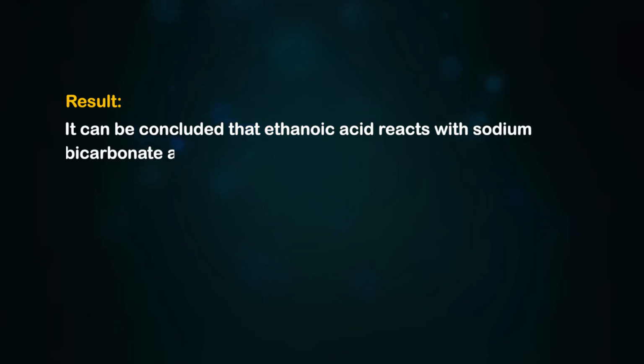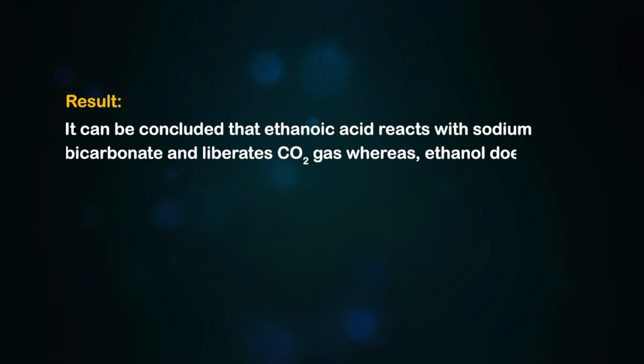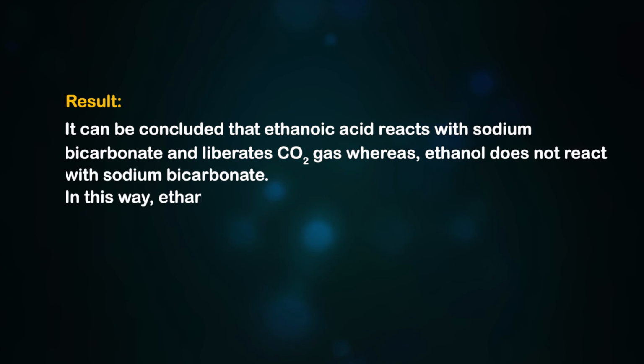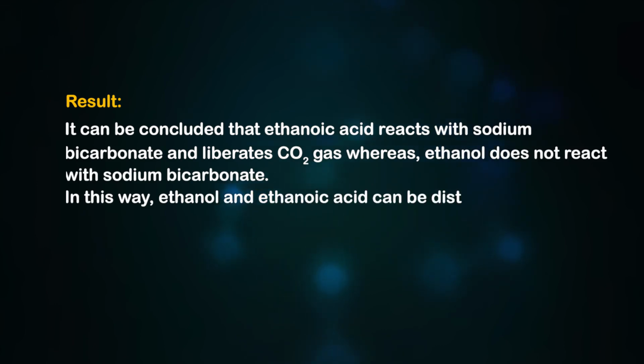Result: it can be concluded that ethanoic acid reacts with sodium bicarbonate and liberates CO2 gas, whereas ethanol doesn't react with sodium bicarbonate. In this way, ethanol and ethanoic acid can be distinguished.